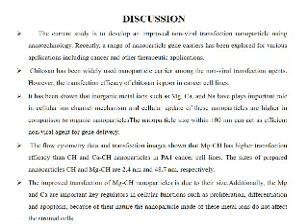Discussion. The current study is to develop an improved non-viral transfection nanoparticle using nanotechnology. Here, chitosan has been widely used as a nanoparticle carrier among the non-viral transfecting agents. However, the transfection efficiency of chitosan is poor in cancer cell lines. Hence, we have used inorganic metal ions such as magnesium, calcium, and sodium, which play an important role in cellular ion channel mechanisms. And the size of the nanoparticle should be within 100 nanometer.